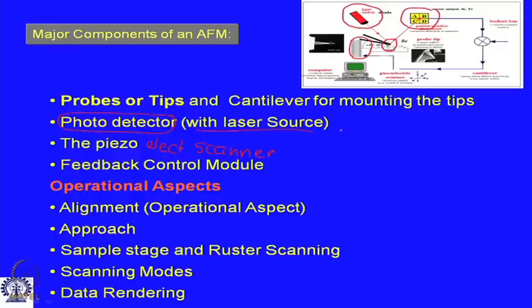So it's a piezoelectric scanner now. And here you see the feedback loop. Of course, the operation of any modern instrument is through interfacing with a computer. So you have a computer interface which runs the whole show. And that's not exactly a hardware of the AFM. That's why I have not included it.